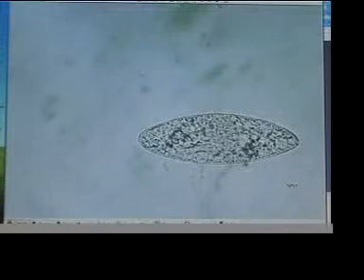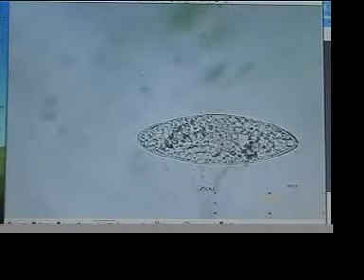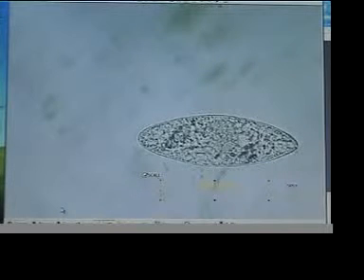This is the 40x objective. I guess I could put the scale up there. I haven't checked the scale today to see if it's right, but let's take a chance. I'll check it later. He seems to be changing shape.